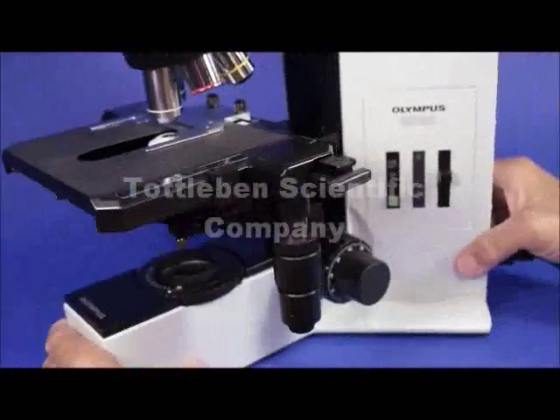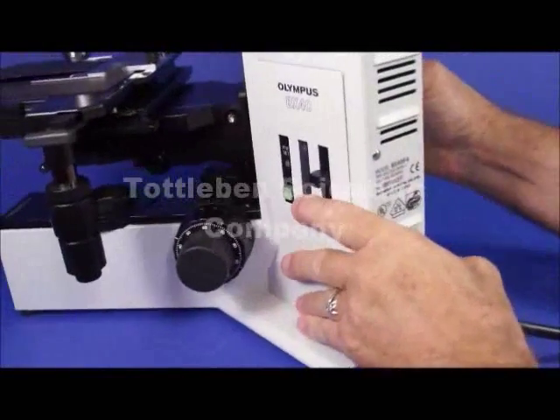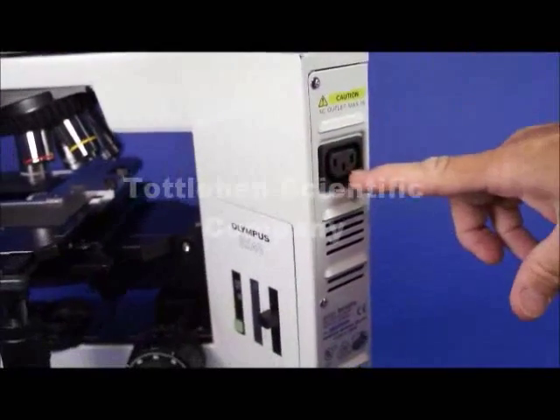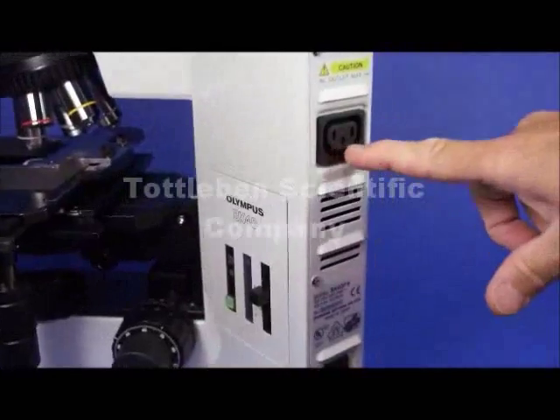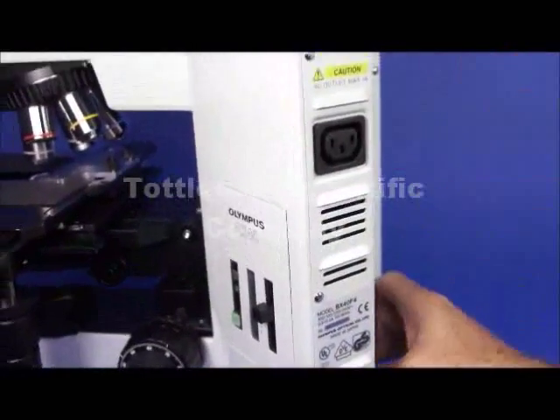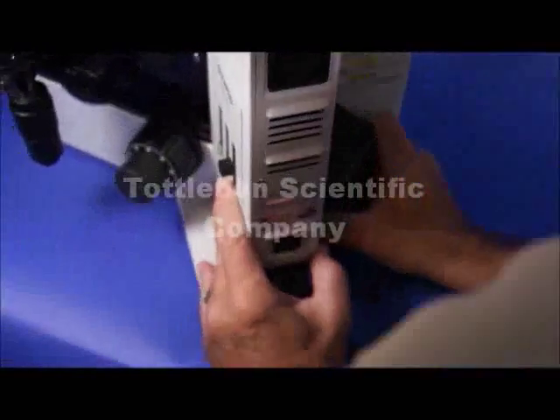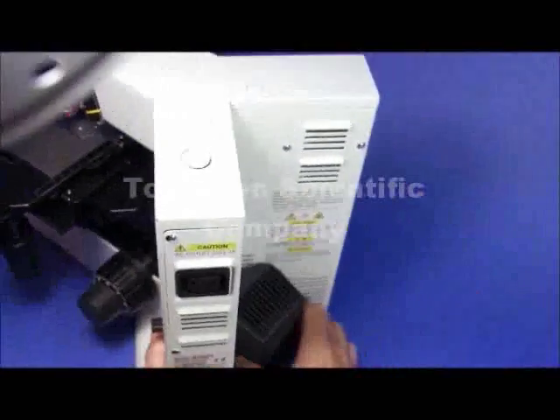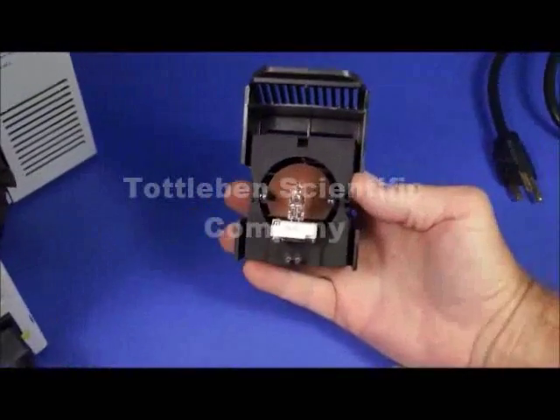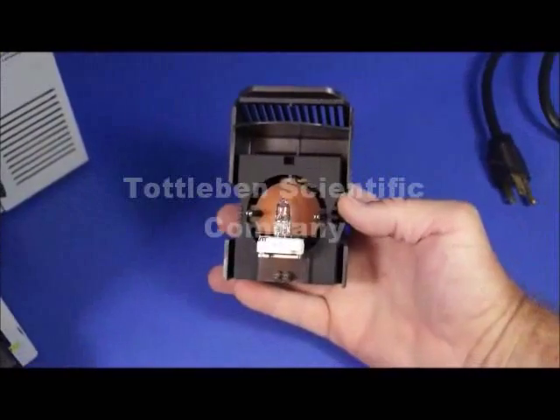Working our way around to the back side, if you're going to equip this microscope with dual viewing, there's an outlet here — all you have to do is plug in for the dual viewing mechanism and you're ready to go. For changing the bulb, it's very simple. Just pull out the lamp housing and there you have access to the 6-volt, 30-watt halogen bi-pin G4 bulb.